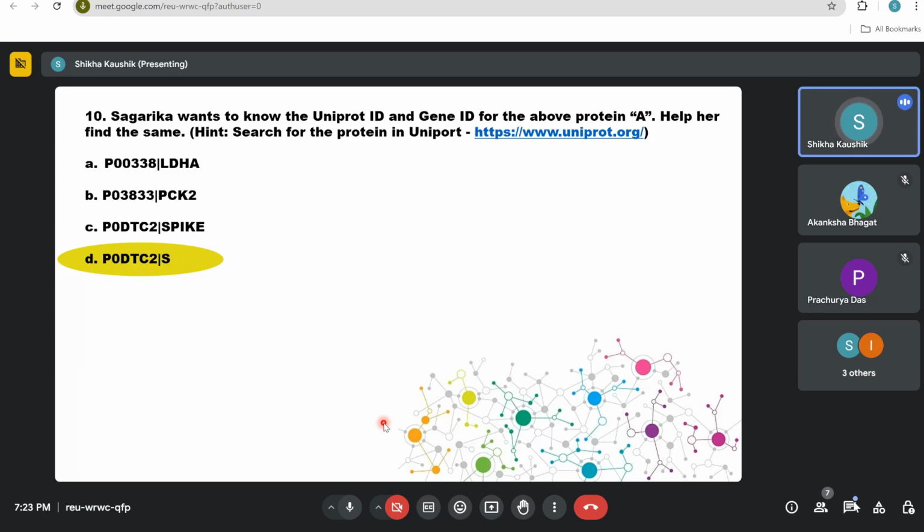know what all software you have to use while analyzing your proteomics data, right? So you get your data in the form of sequences, और फिर उनके नंबर्स भी होते हैं, उनकी क्वांटिफिकेशन एक अलग टेबल में दिया होता है, but mostly if you want to identify a protein then the protein identification is done through sequence only. So you just normally run your BLAST or your protein BLAST and you get the details of your protein. And if you want to know the ID or UniProt ID or gene ID, then you have to use some other software to get the exact ID.